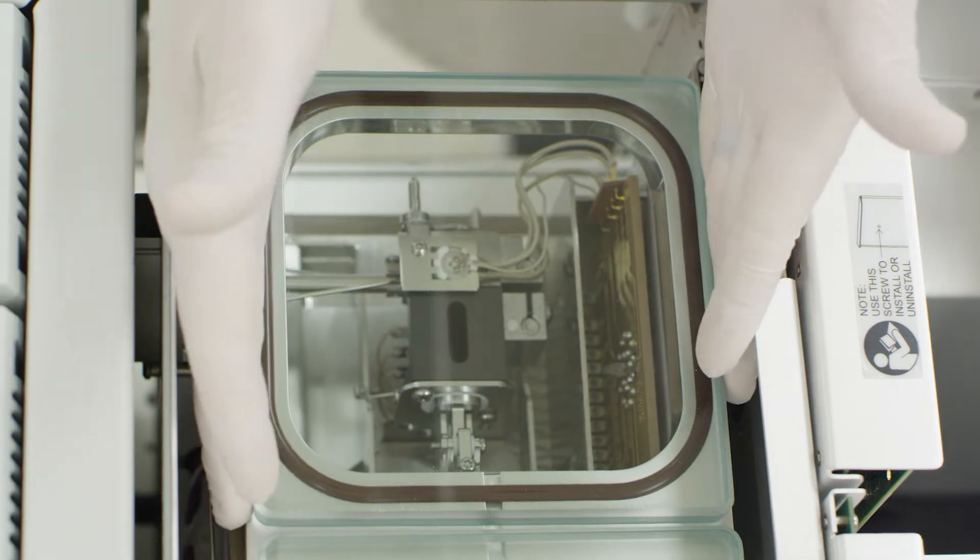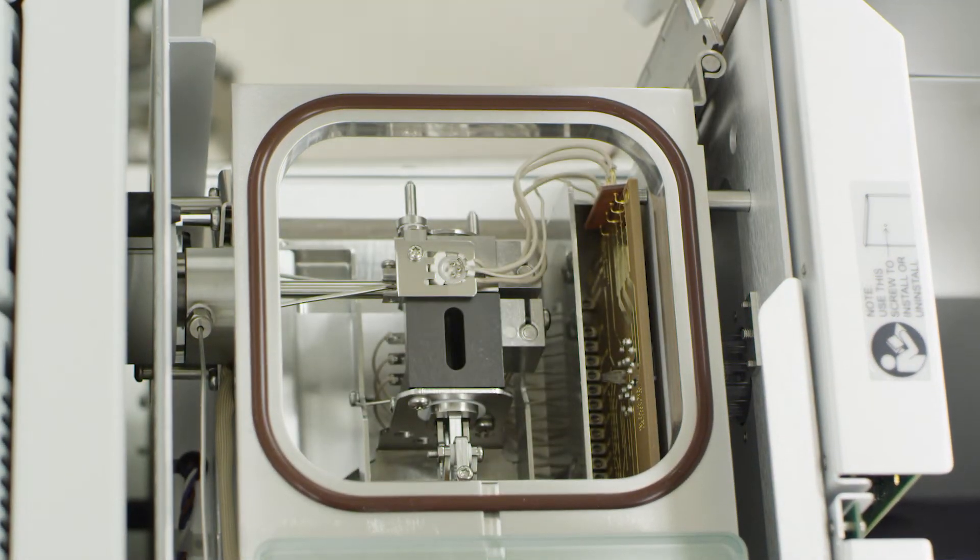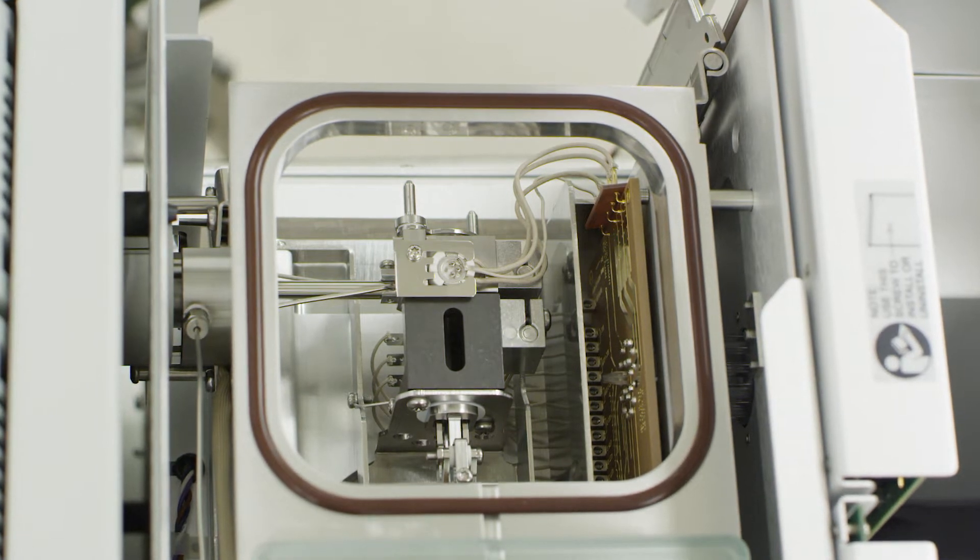Remove the glass top to allow greater access to the top side of the source assembly. Do not pry with sharp tools as this could risk damaging the seal to the chamber.